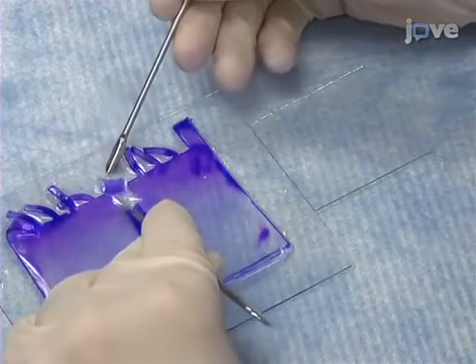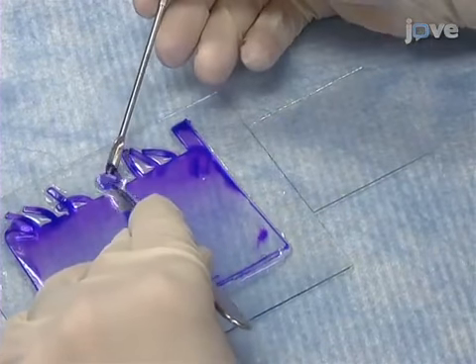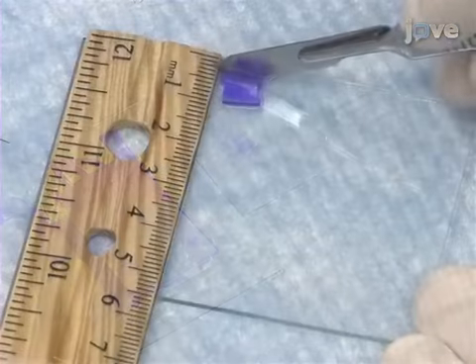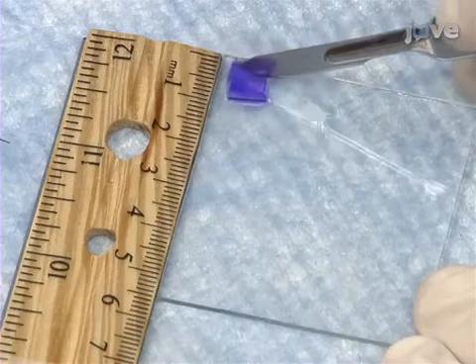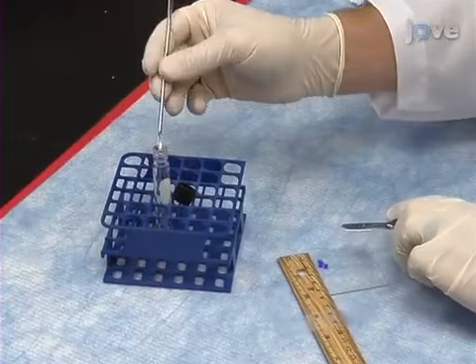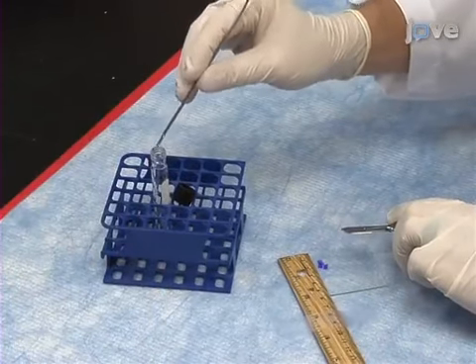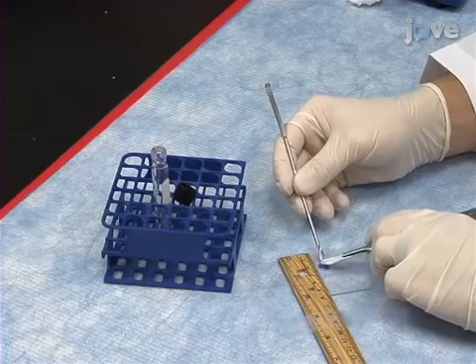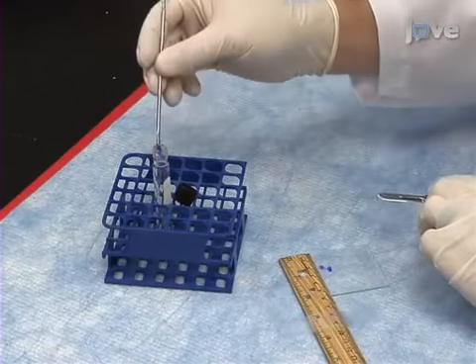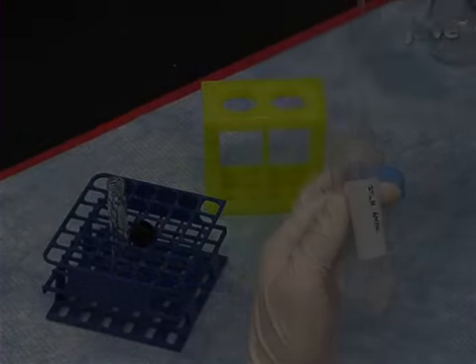To increase the yield of O-glycans, transfer the gel band of interest onto another glass plate and cut the piece into approximately 2 mm cubes. Transfer the small gel pieces into a 13 by 100 mm screw-top glass tube with a stainless steel microspatula. Next, add 1 ml.